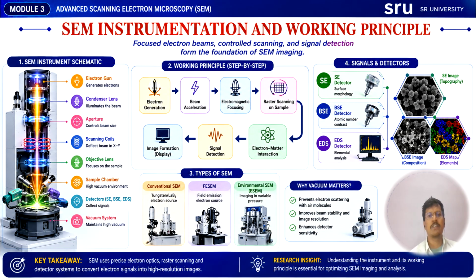We also discussed the instrumentation and working principle of SEM, and the major components of the SEM instrument in detail in the previous video.